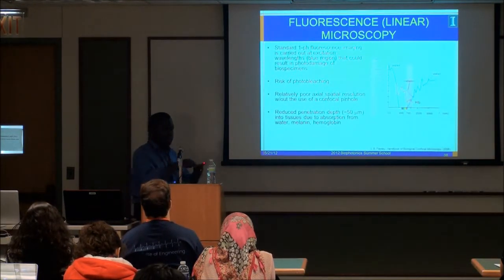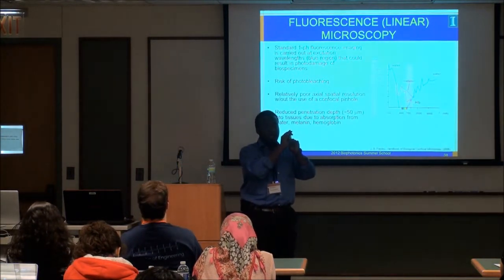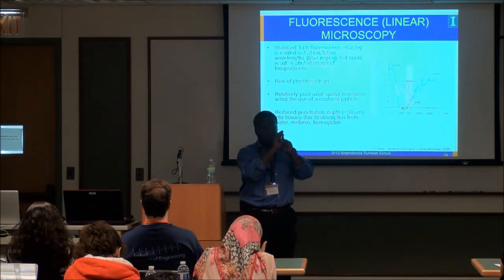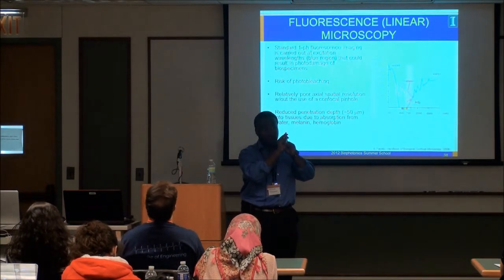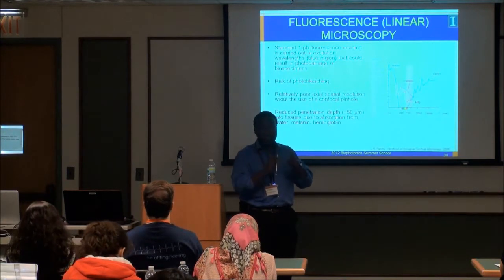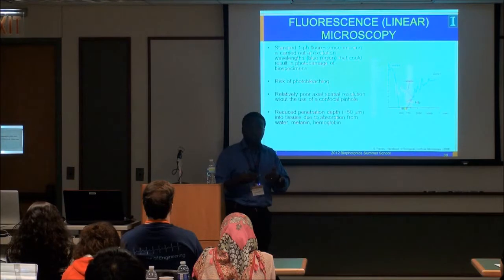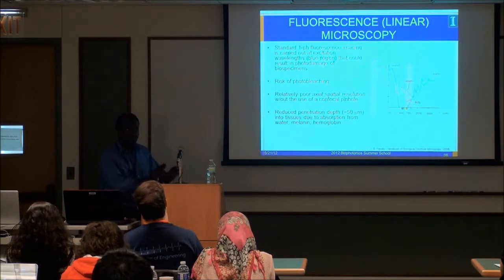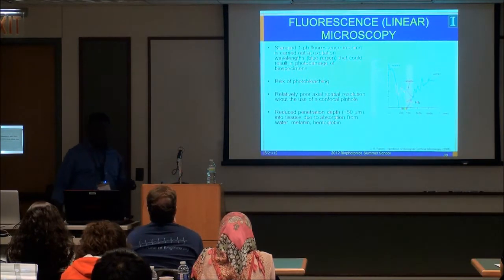It's like I shine this red laser point onto my finger. The scattering of this tissue is very different for red than if I were to do it for green. You'll see this thing light up a lot less at green, because more of the light's being absorbed. Ultimately that puts a hard stop on how well your light can penetrate into tissues. For regular linear optics, we're talking about a penetration depth on the order of 50 microns.